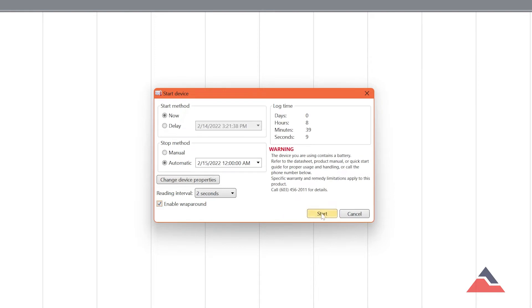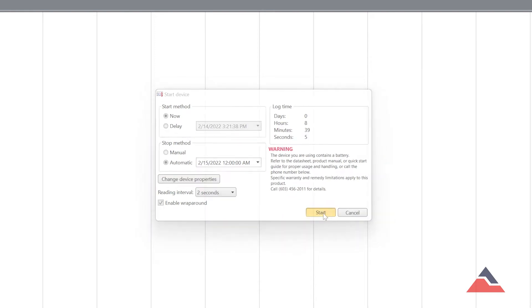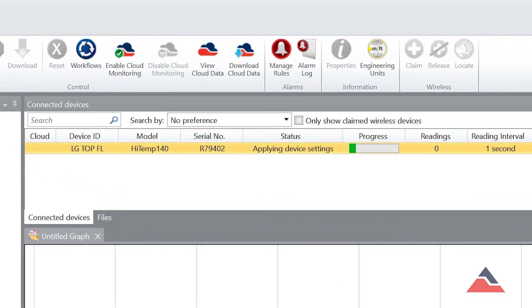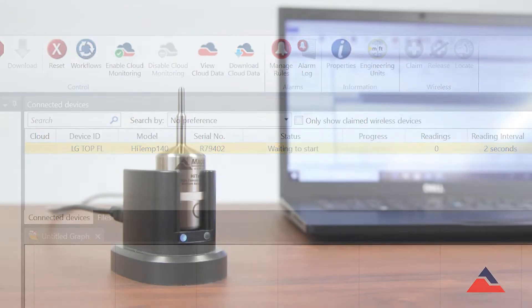Once your device has been set up, click Start. After hitting Start, the device status will change to Running or Waiting to Start depending on your selected start method.